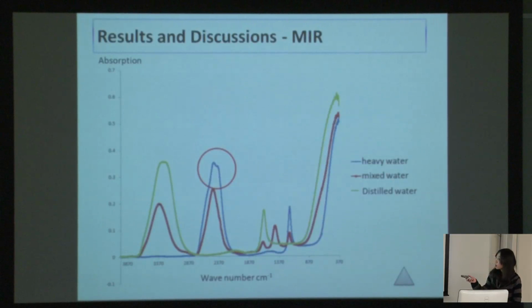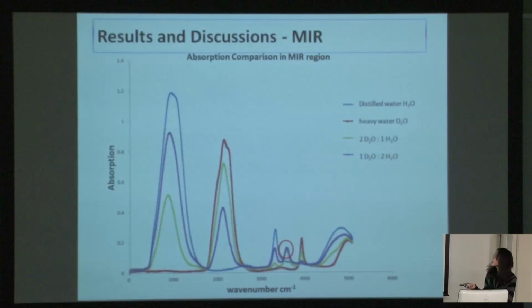And also we can see from this figure, here is a new peak for the mixed water. I assume it is because the HOD band caused this band. So in order to confirm whether it is the HOD band or not, I conducted the experiment again.